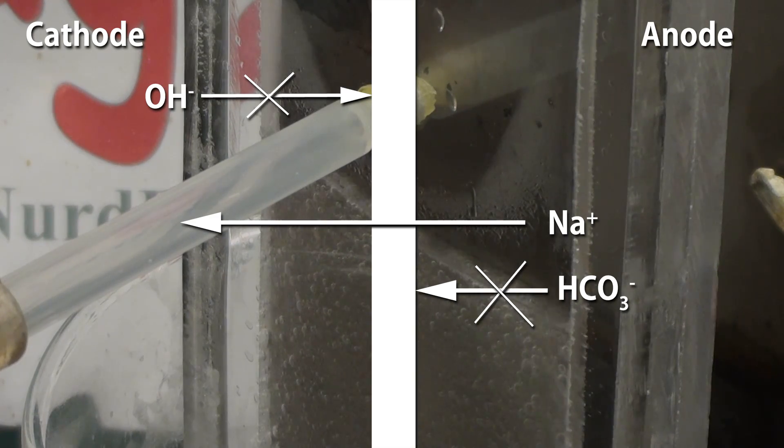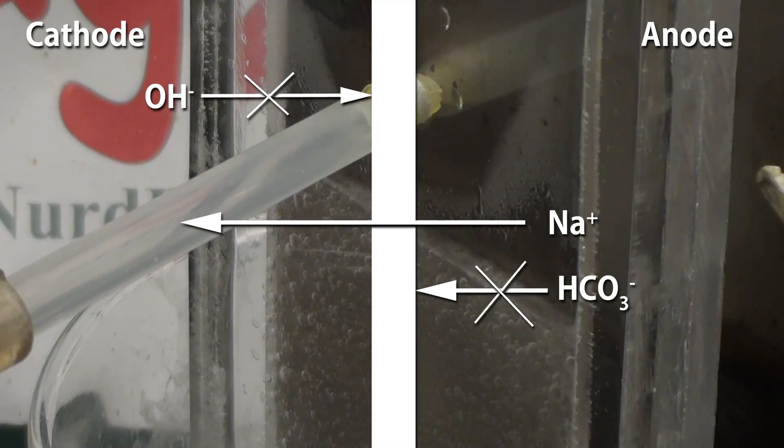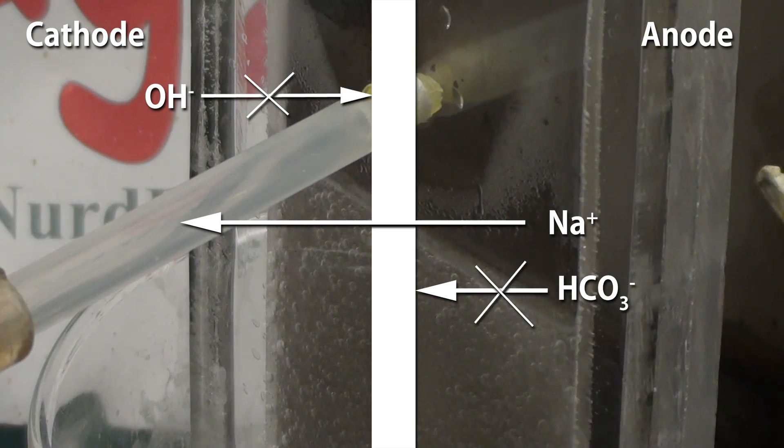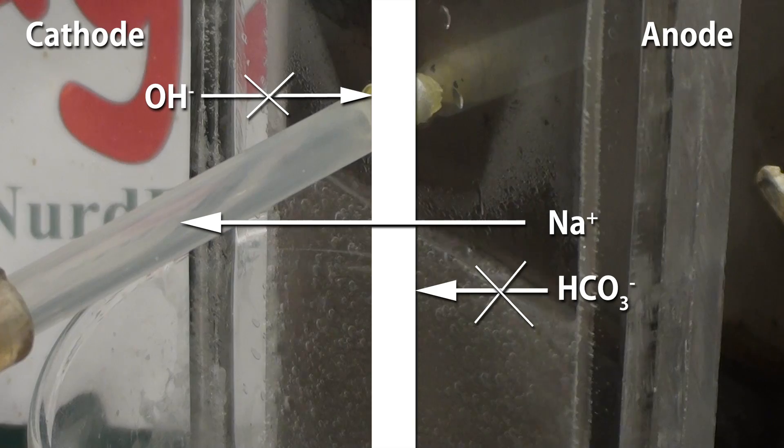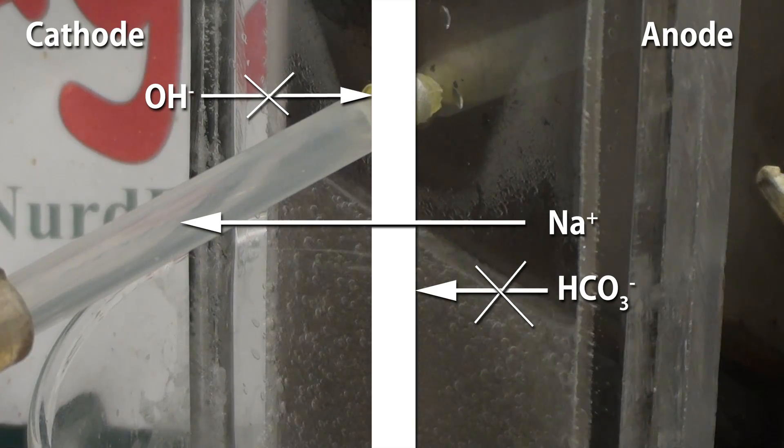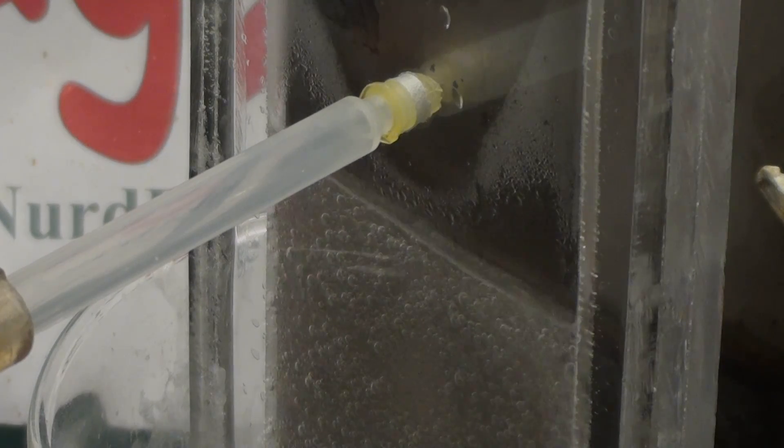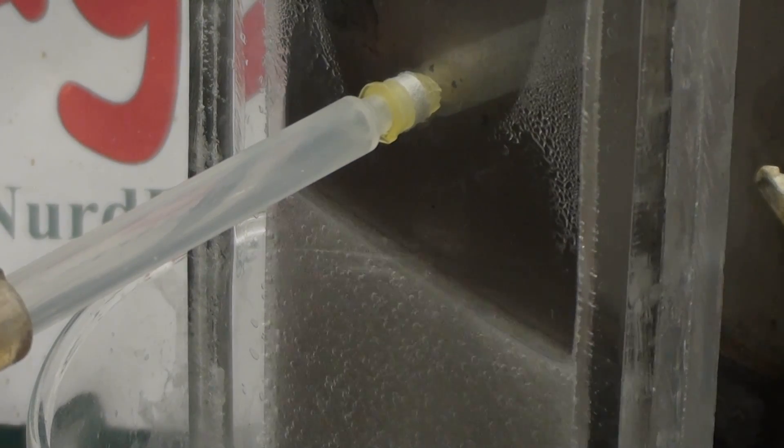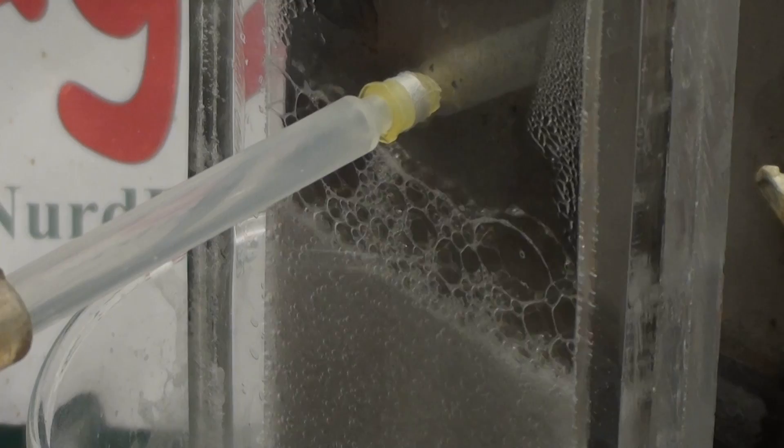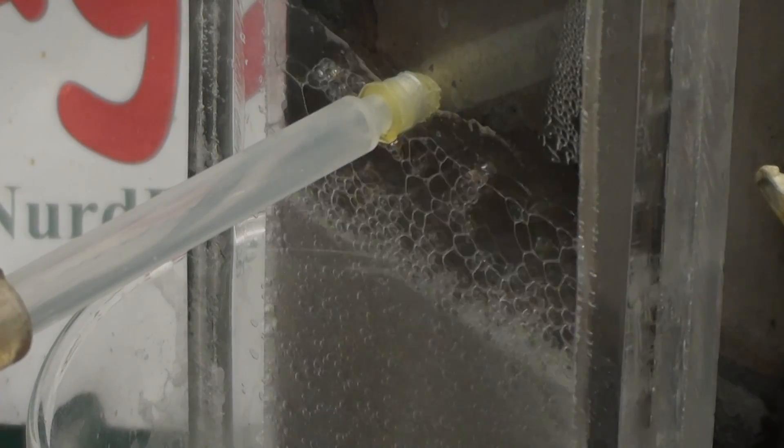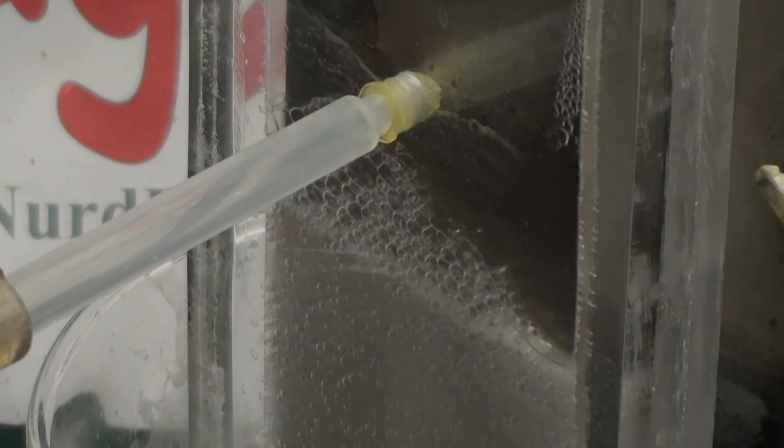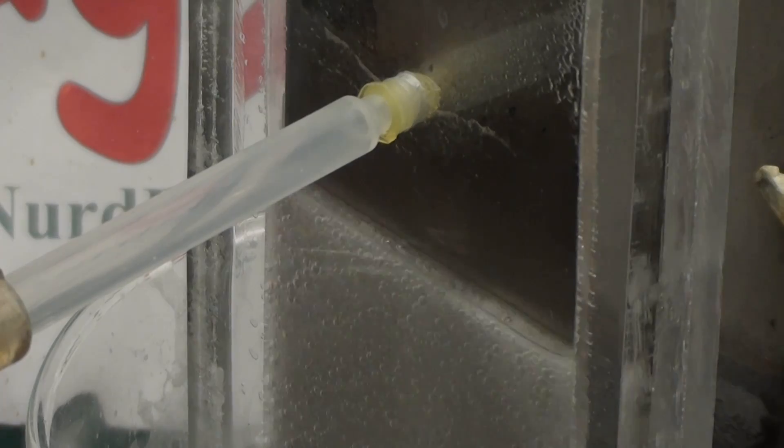So they get pulled through by the driving force of the electric field. The bicarbonate ions in the anode compartment are anionic so they remain behind. Overall we produce sodium hydroxide in the cathode compartment. If we didn't have the membrane the sodium hydroxide would start reabsorbing the carbon dioxide and producing sodium carbonate and bicarbonates again. We'd never separate out our sodium hydroxide. This is why we couldn't simply electrolyze sodium bicarbonate by itself.